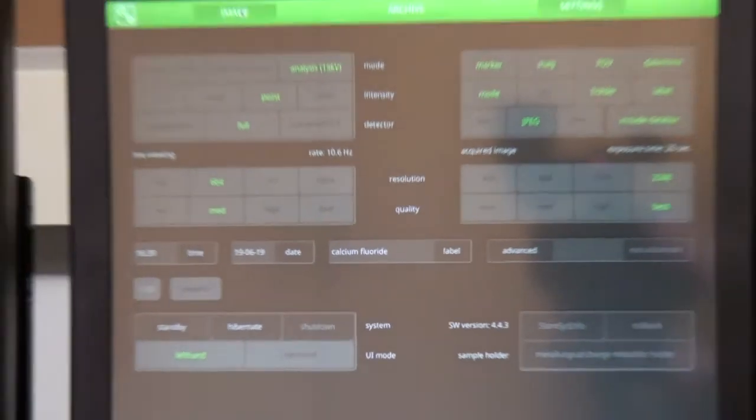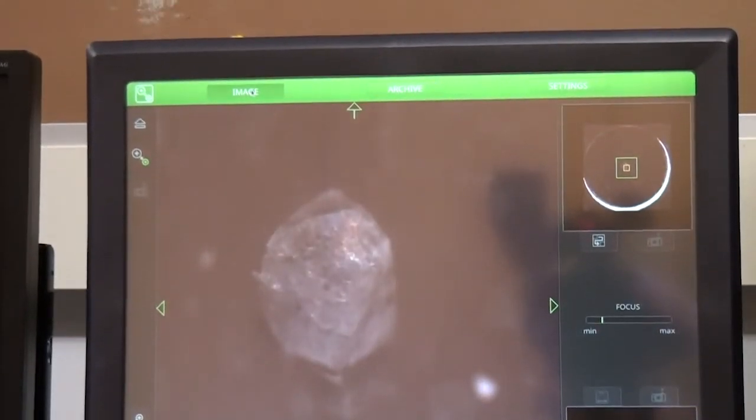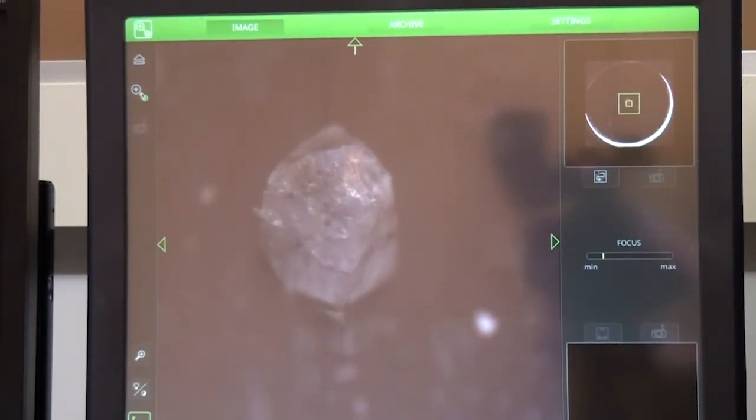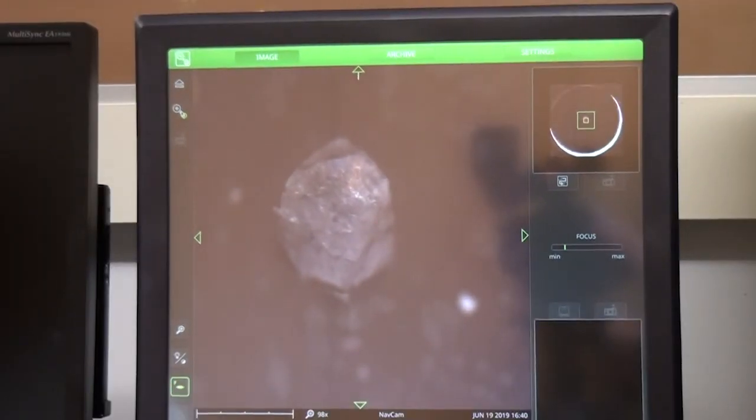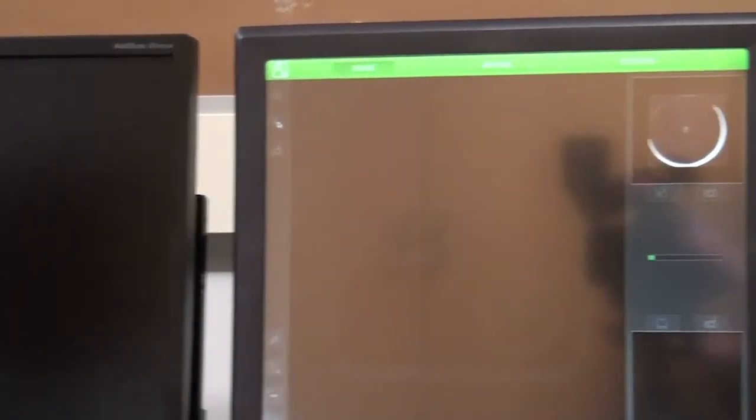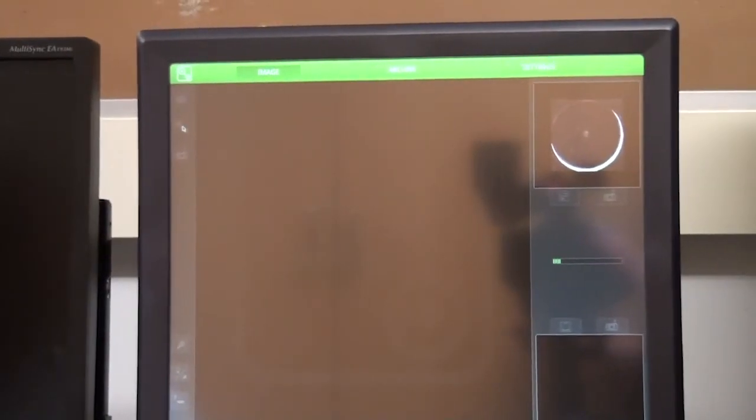And we toggle to the SEM mode, and the SEM starts to generate the image.